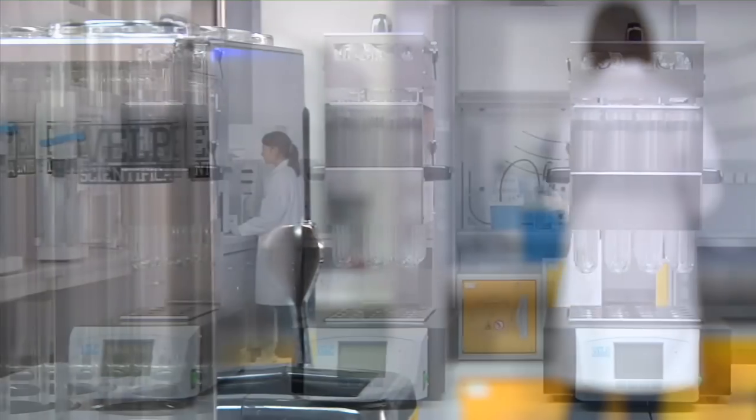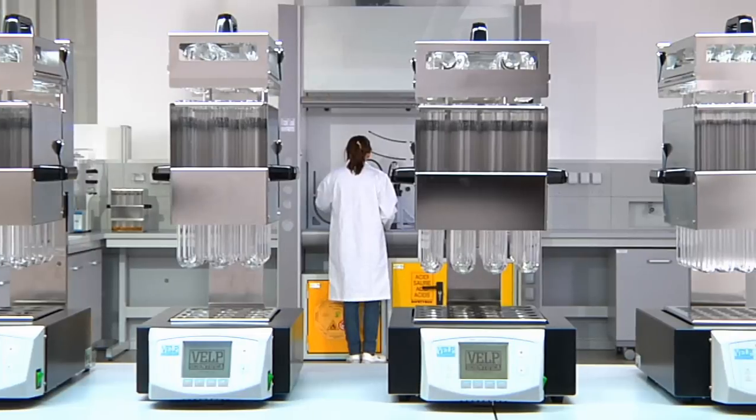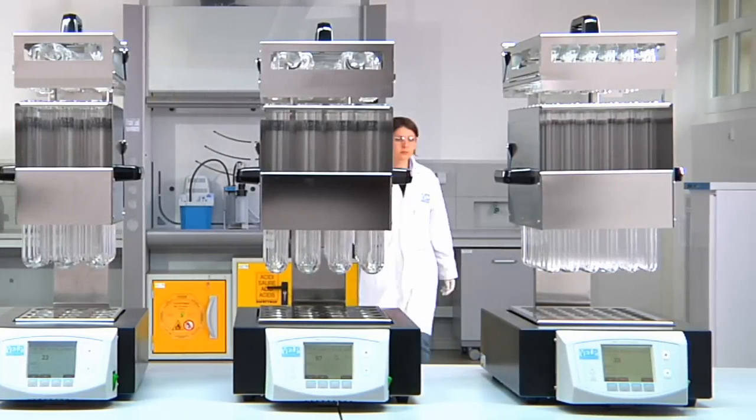Units accept 8 standard 250ml, 12 250–400ml, 20 250ml, or 42 100ml Kjeldahl digestion tubes.